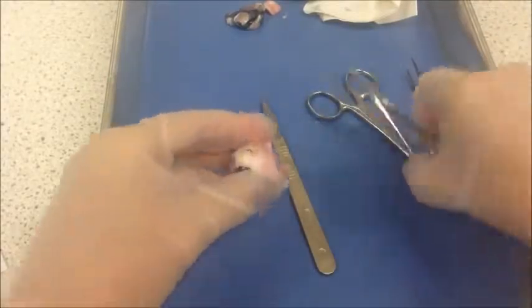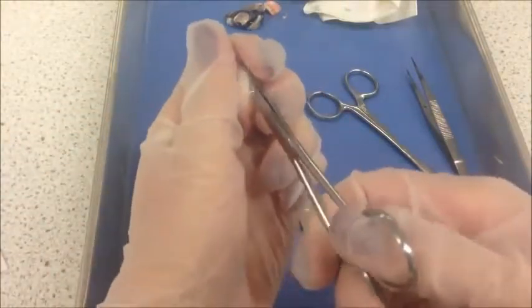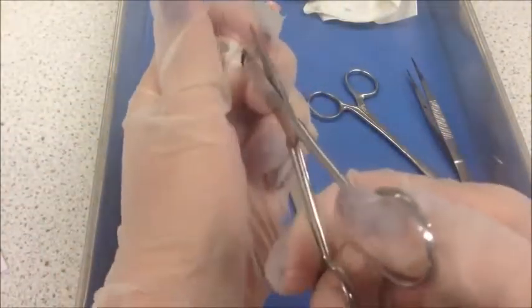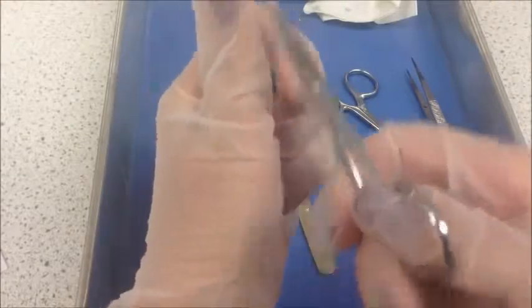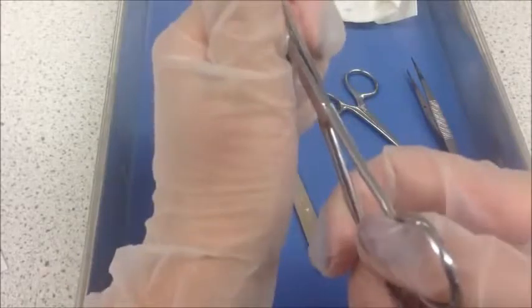You will notice as I'm carefully cutting into the eye with the scalpel, it takes a lot of force to break through the sclera. The sclera is the white part of the eye, covering the outside. The sclera is very thick and made up of many layers of tissue.